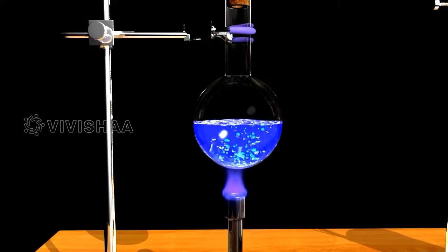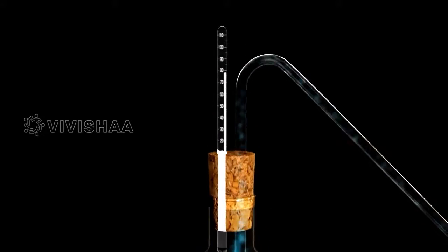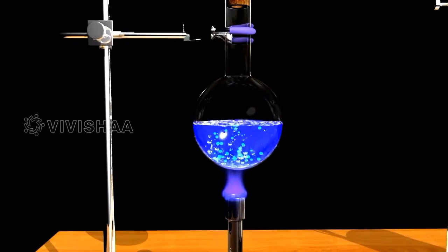As we heat the distillation flask, ethanol in the liquid mixture will begin to boil at 78.4 degrees Celsius and start to vaporize.